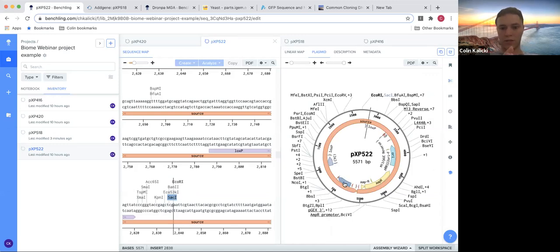So we come over here to TEF promoter. So you always need to start your gene with a TEF promoter. We're actually going to get right into this now. We're actually going to start making the plasmid to code for the GFP. And so you want a promoter, like I said, it's going to initiate transcription.